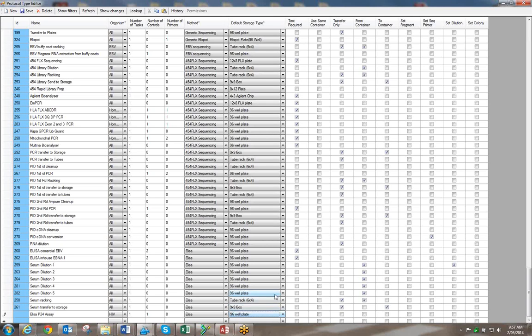Okay, and then these columns here indicate whether a test is required. When you perform an assay, obviously for ELISA, you want to have a look. You're going to do spectrophotometry there to see whether it's worked or failed. So I would say yes, a test is required. When we come to it, when you say the task is processed, it will turn dark green, and then you assign whether your sample has passed or failed. It won't let you go to your next task until you have assigned that the samples have worked or failed. So that's what this test required does.